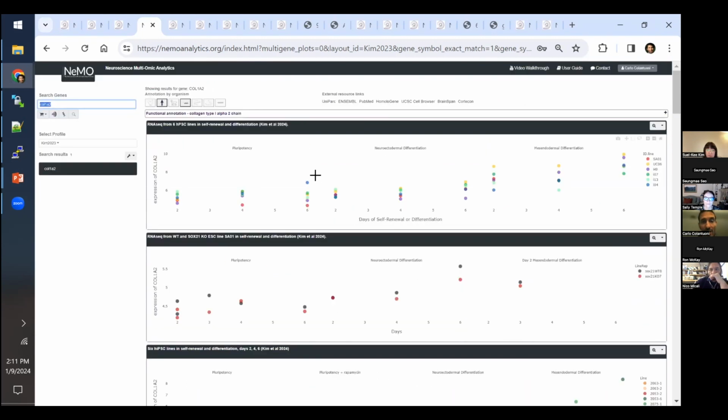But what we can see already here, the expression of that when off target, meaning off target for dual SMAD inhibition, this collagen gene is being turned on spontaneously in line I4 in pluripotency. This turns out to be the line that Silke showed right after Taylor showed this gene that is not responsive to multiple doses up to 10 micromolar, by the way, which is right in the middle of the low dose of Taylor's. So it kind of brings together a lot of what we've seen today.